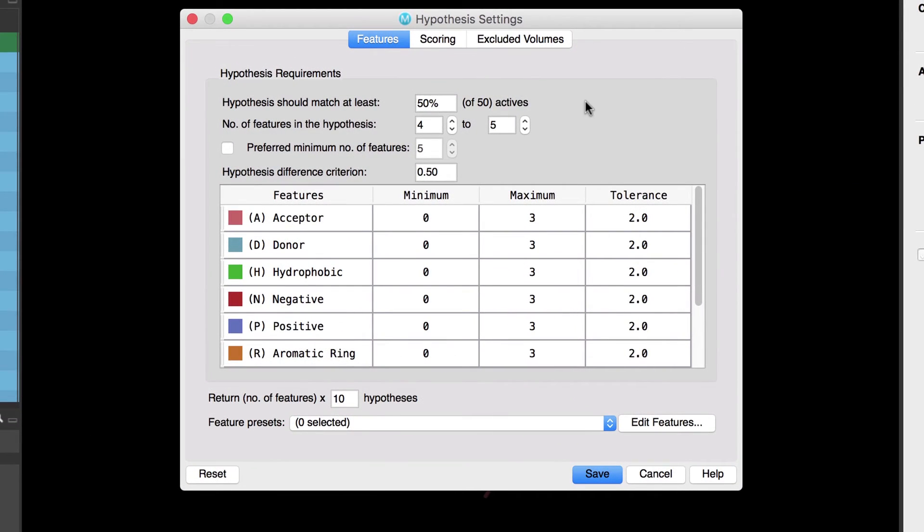Here in the features tab it shows the options relevant to the selection of features in the common pharmacophore. In this example we are looking to recognize pharmacophore hypotheses in a diverse ligand set so we will want to set some non-default options.